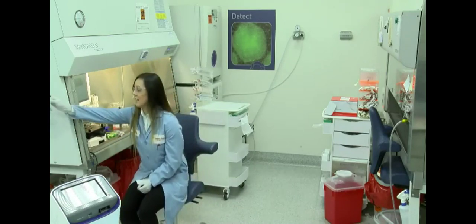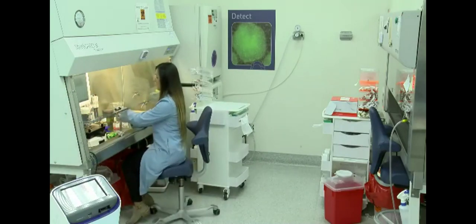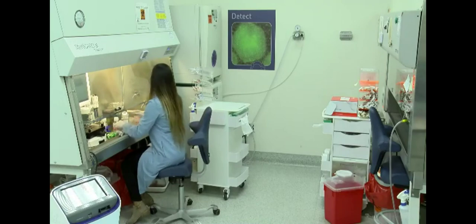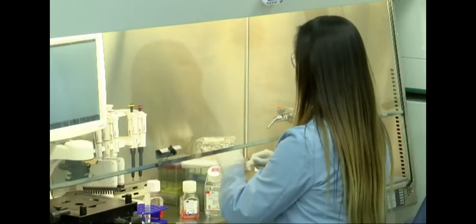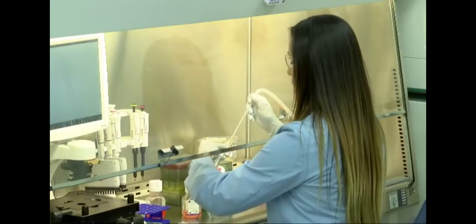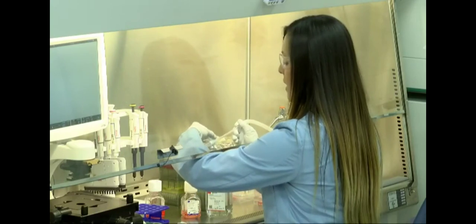And looks like our cells are done. So once we have our pelleted cells, the next step would be to aspirate off the supernatant so that we just have our cell pellet down below.